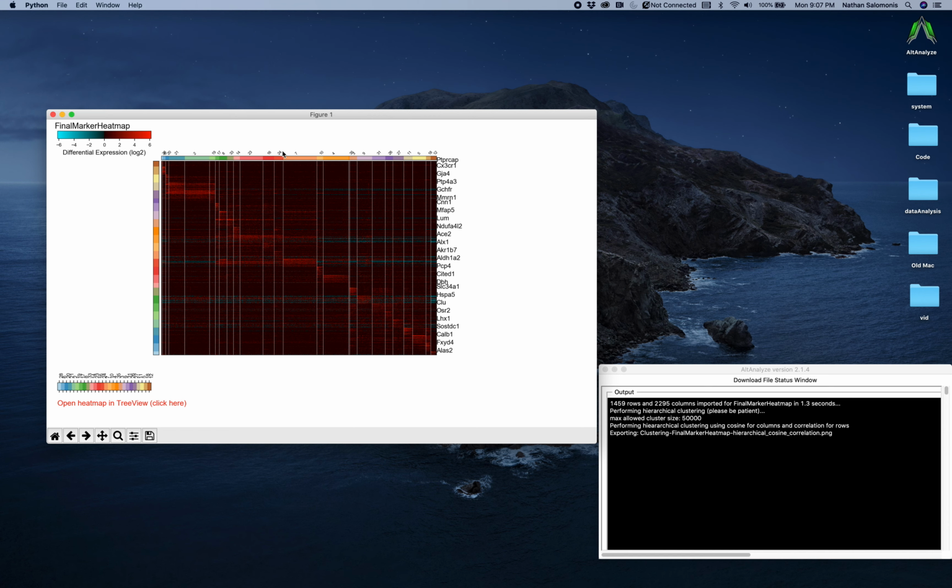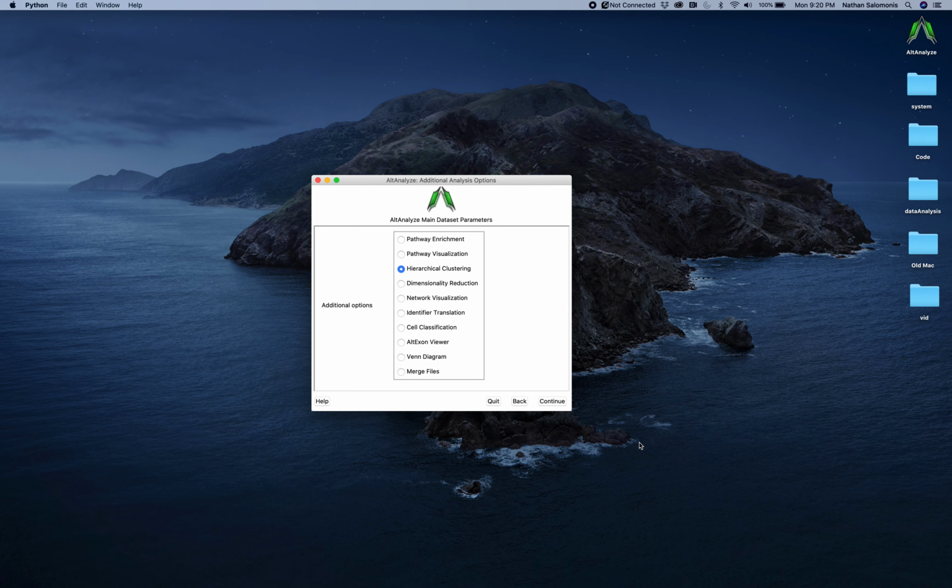In this case, these are just numbered clusters, but you could have the name of these clusters be T cell, neutrophil, or whatever, and they would be displayed here at the top or displayed down here in the legend. You can also put additional metadata in the groups file to view in this type of file. So those are some very basic options for generating heat maps in the software.